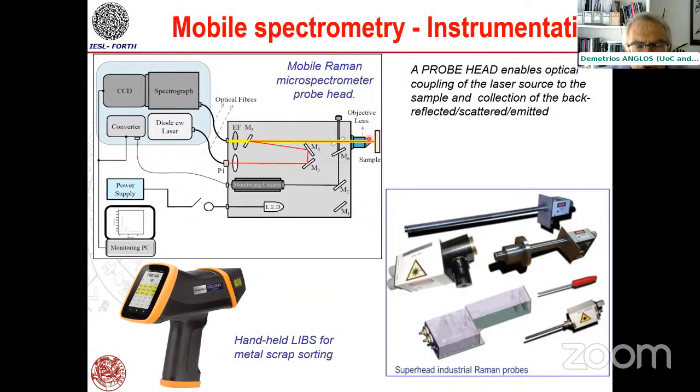So this microscope objective actually turns this probe head into a micro probe.